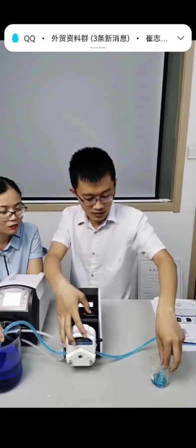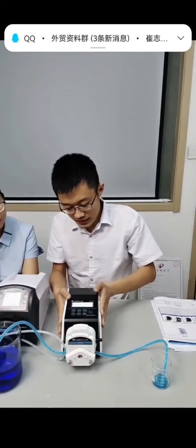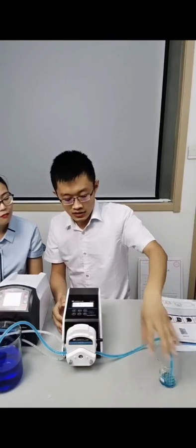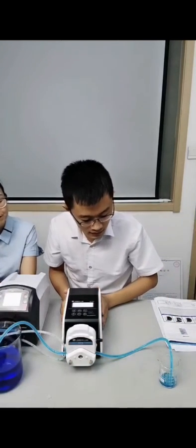That's the main function of this pump. Transmission of liquid. Any liquid you can transmit. And also other corrosive liquids.